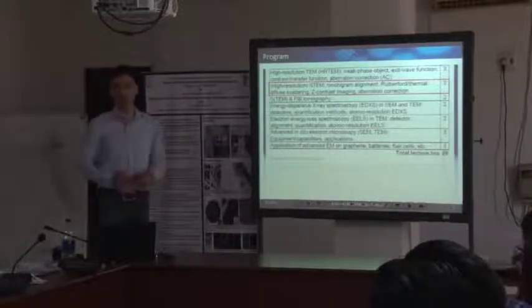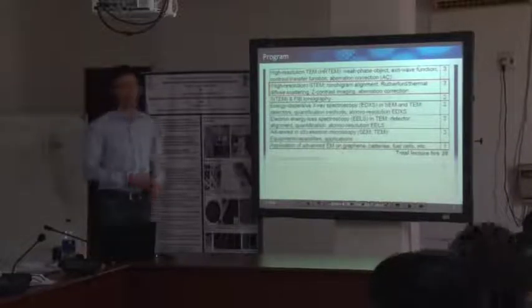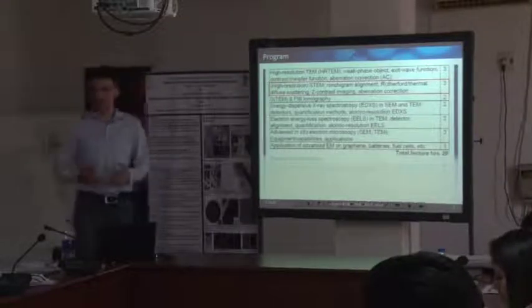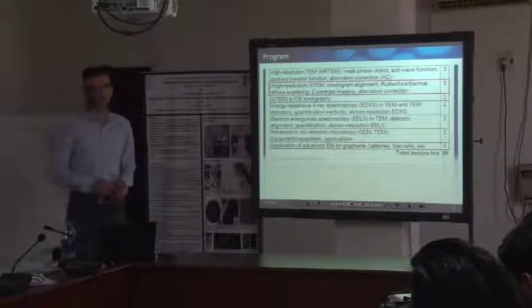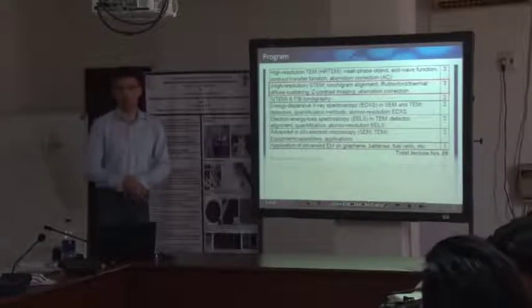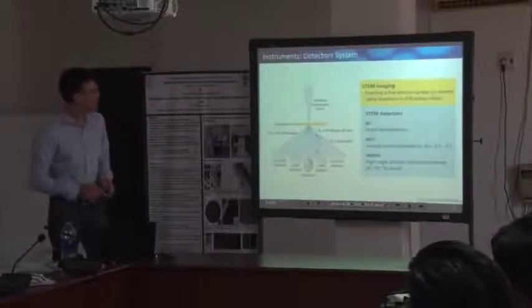It's very powerful to gain direct insight into the local chemistry of the material. It's not only about diffraction contrast. And I will spend the last third on aberration correction, just to demonstrate the modern capabilities of modern microscopes.